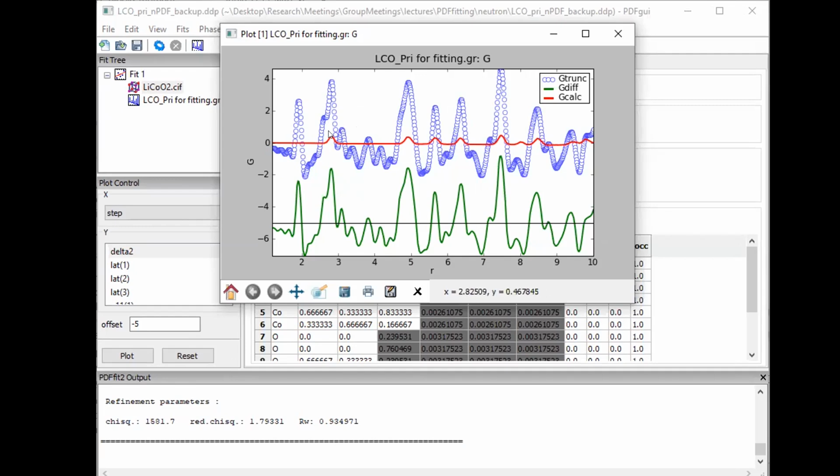So I need to walk back a little bit. As I said before, these peaks are solely contributed by oxygen, but I should be a little more conservative. They have a small contribution from the cobalt, right? But you can see this contribution from cobalt is so small. It's actually not comparable with oxygen. So we can still reliably use these 3 peaks to analyze the oxygen correlation, and we do not have to really care too much about the cobalt correlation.